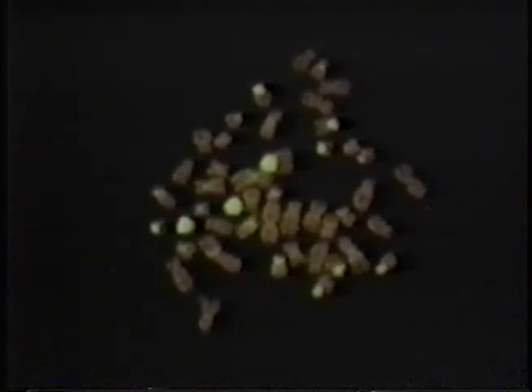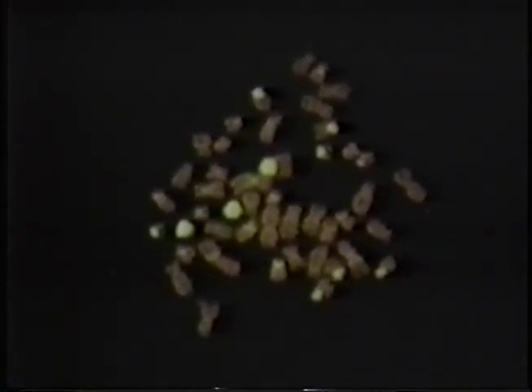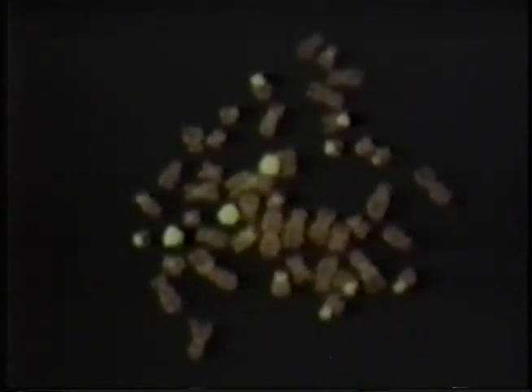The other application that I'd like to mention just in passing is in prenatal diagnosis. One of the most common events that's found prenatally is trisomy 21 associated with Down syndrome. Finding or scoring cells for trisomy 21 usually requires an experienced cytogeneticist. In this case, if you take a probe for chromosome 21 and hybridize to a metaphase spread, you can see the 3 number 21 chromosomes almost at a glance. And so it makes the technology much simpler to apply. It increases its accuracy, and it increases the speed of analysis. And probably it will eventually set the stage for almost complete automation of the whole approach.